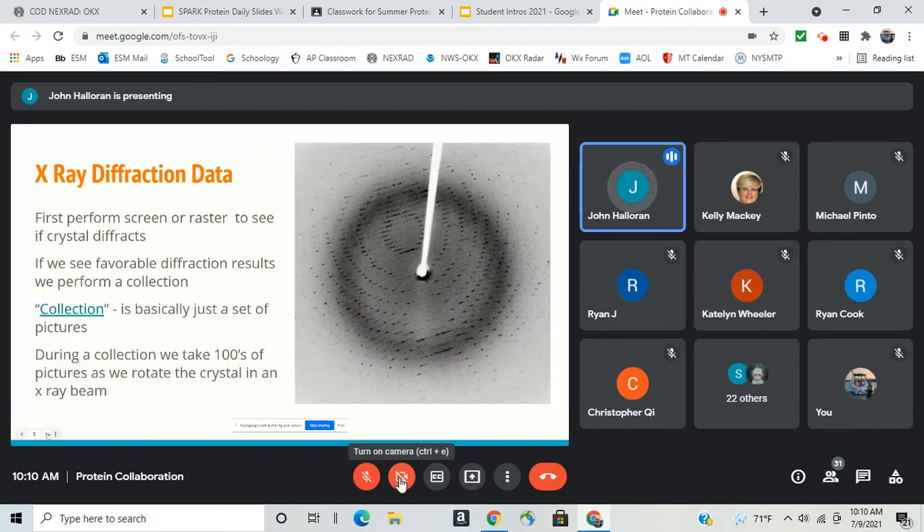This is a typical diffraction pattern — your first set of data. When we're at the beam, depending on which beamline you're on, we either screen or raster. At NYX we do screens where we shoot the crystal three quick times to see if there are any dots showing up, whether the crystal is diffracting, and whether it looks like a protein or a salt crystal or has lots of ice.